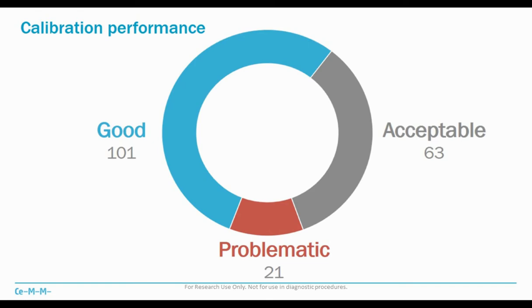And there were some compounds where we really had problems with calibration. In some cases this was a sensitivity issue, so we were a bit on the lower range, and we had 3 or 4 points in the calibration curves. And for some analytes we really started to observe some issues with stability.